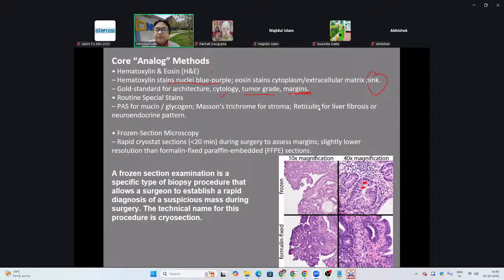We saw some of these before, so there's no need to go back to that again. And other ones I mentioned the other day was mucin. You sometimes need to stain for mucin, to be able to see if certain cells make too much of it or not. And sometimes special stains for liver fibrosis. They have other stains called reticulin, and so they provide extra information.